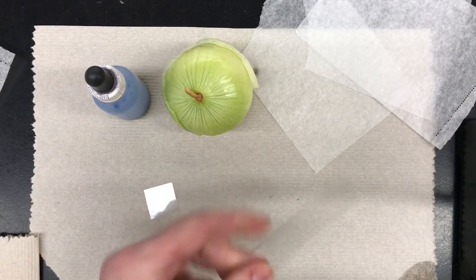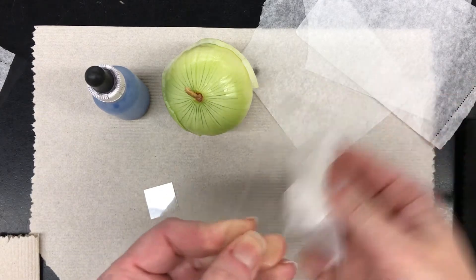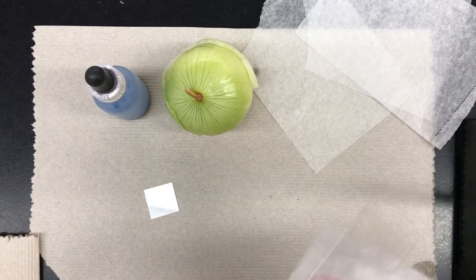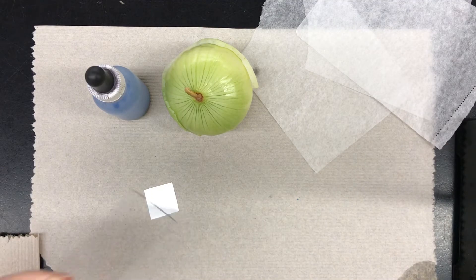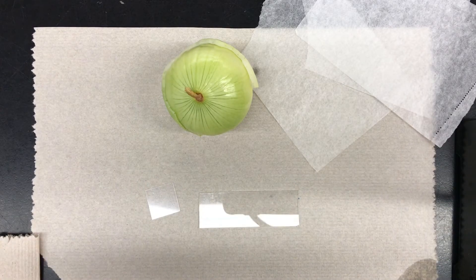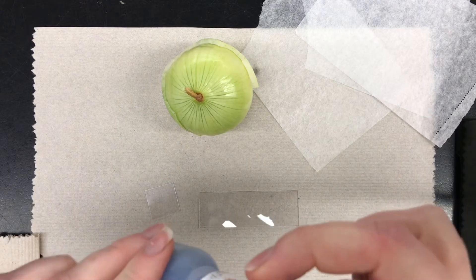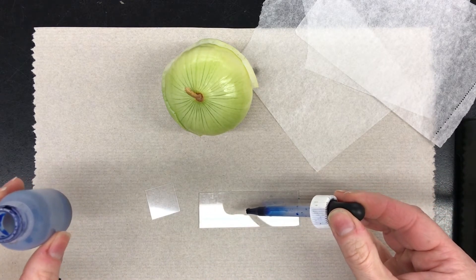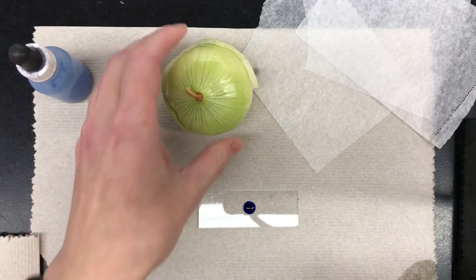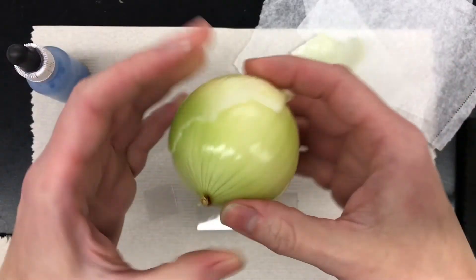First, make sure that your slide is nice and clean, then dry it off. Take your methylene blue and place a small drop right in the center of your slide. Put the cap back on the methylene blue, then come up to my desk and I will give you a piece of onion skin.